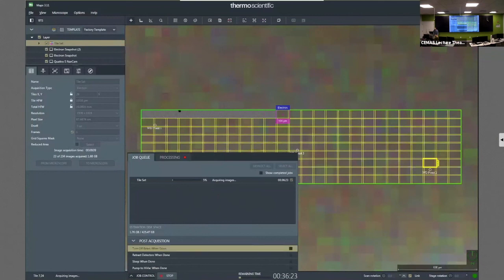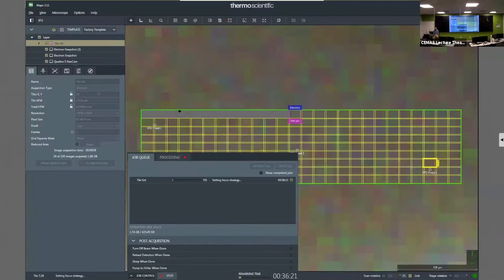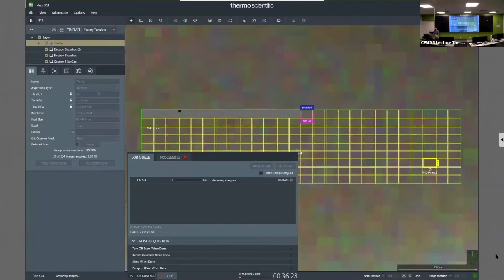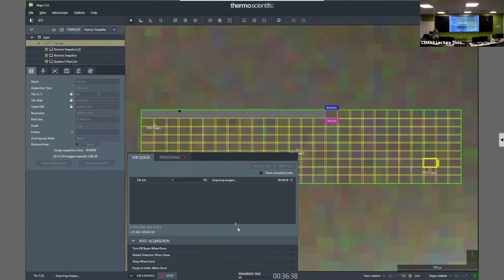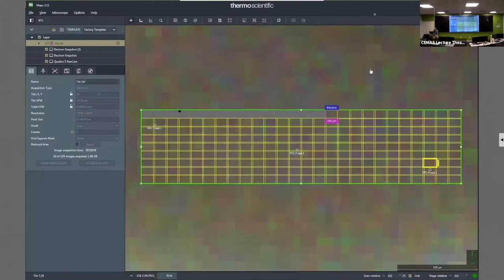On the Maps software version: this is version 3.11, on the Apreo and Quattro. It's about a year old. Importantly, files collected in 3.11 can be opened in 3.7, but not vice versa, so always note which version you're using. There is free software to view Maps files, but analysis and stitching require the full software on the instrument computer. When you stop a job mid-run, there's a specific workflow to follow to complete the stitching from partial data.